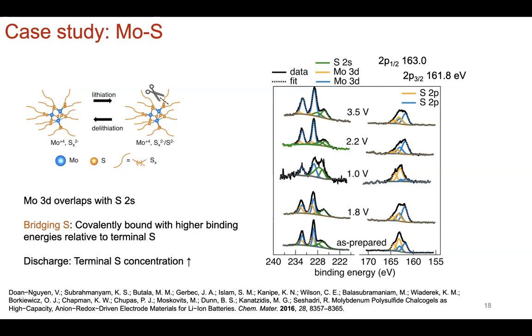And so what we can see is that we can track the different sulfur species. Before, we looked at different oxidation states of sulfur, right? We had sulfur, sulfite, sulfate, so different oxidation states. We can apply that similarly for these polysulfides, because if you have the polysulfide species, you're expecting a 1- oxidation state.